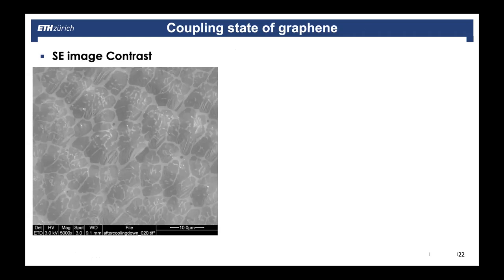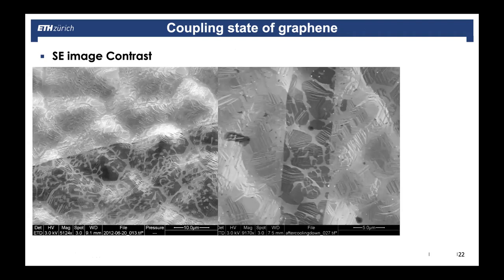So I was at the beginning not believing that it would be possible to see a monolayer of carbon at the 1000 degree hot surface with secondary electrons. But we were able to detect it by contrast, and we later confirmed it's graphene. But it's even more crazy. When you take out the sample after growth and you leave it outside in a room in ambient conditions, and then you put it back to the microscope, we saw that the graphene islands on some grains basically lose the dark contrast.